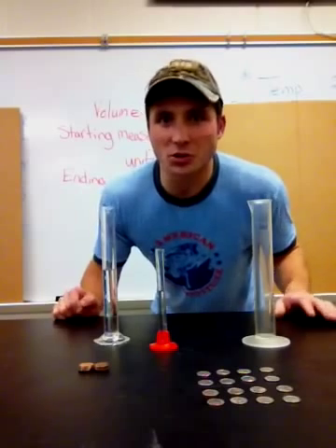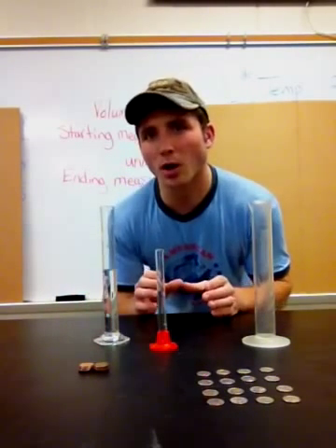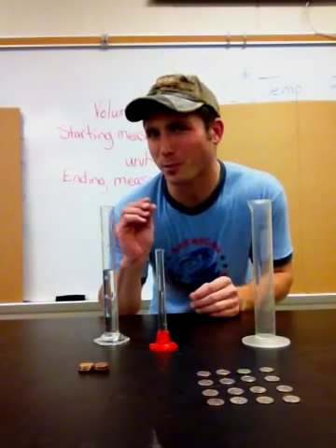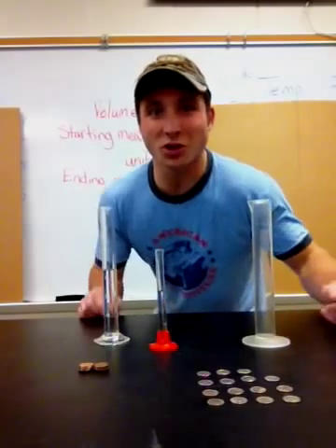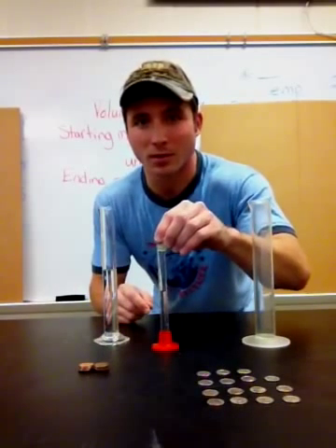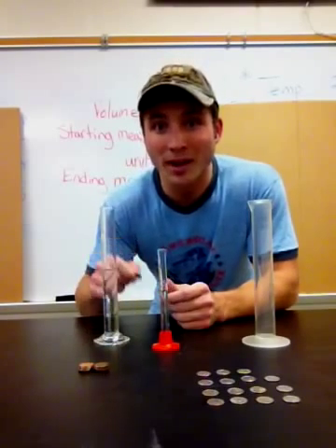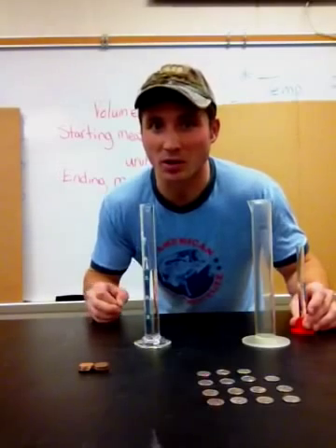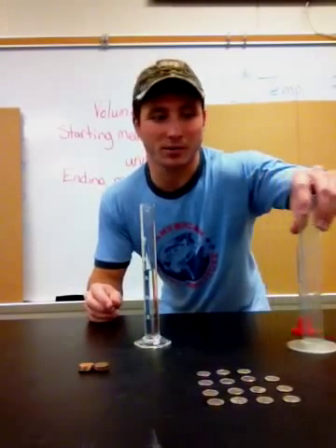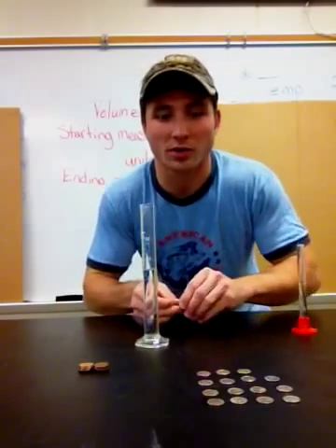The first thing we need to do is decide which graduated cylinder to use. You want to use the smallest one possible so you can get the closest to the exact measurement. I'll try this really small one — oh, this dime doesn't fit in there, so I'm gonna have to go up to the next one. Here I have a 50 milliliter graduated cylinder. My dime should work there.